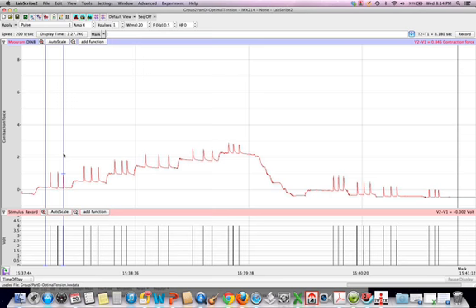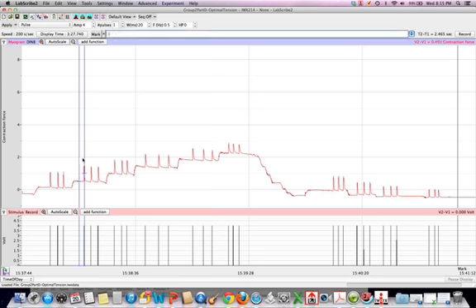Then what you did is that you added another length to it. You added some more tension to it. You can see that in how this is a force transducer. When you cranked on it and added passive tension to that muscle, it went up a little bit. And so now we can place this cursor here at the bottom and the top, and this cursor close to where we have it here. And you continue to do the process.